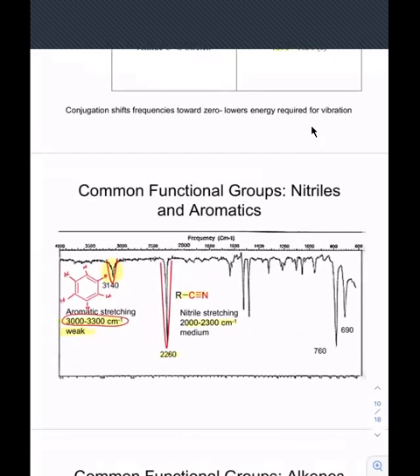Again, infrared is not, I'm saying not hard relatively, because the technique and the actual instrumentation is very complex. But the idea of what you're able to determine from it is a fairly simple idea. You bombard a sample with electromagnetic radiation in the infrared range. When the stretching frequency of the bonds in the sample matches the frequency of the radiation, it absorbs it, and then you get a spike in that area, whatever the wave number is.